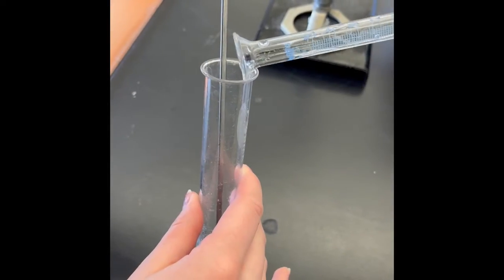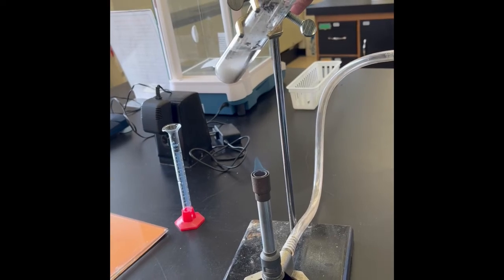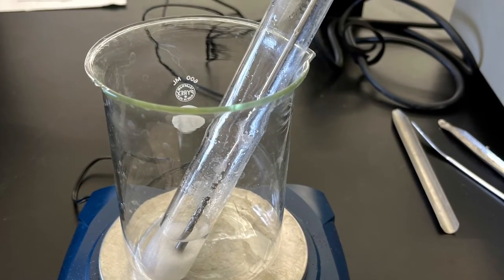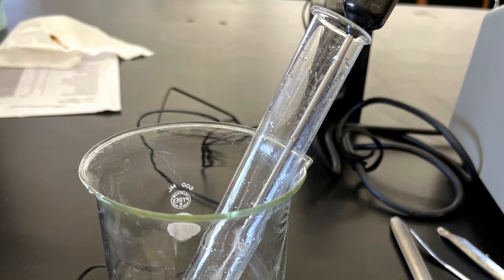and 5. Continue this process of adding a measured quantity of deionized water, heating the solution to completely dissolve the salt, allowing the solution to cool while stirring, determining the temperature of crystallization, and weighing the cooled apparatus until a total of at least 6 weights and temperatures of crystallization have been recorded.